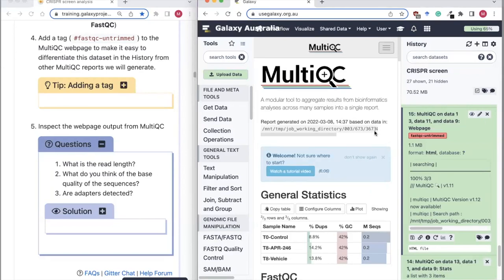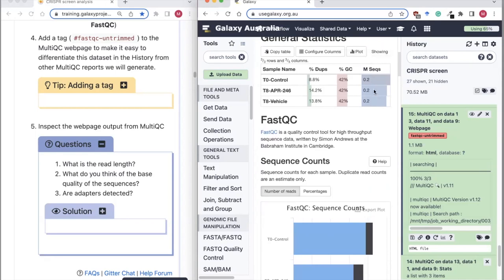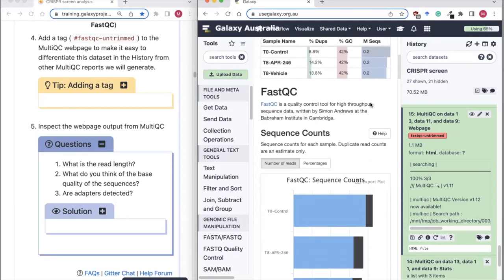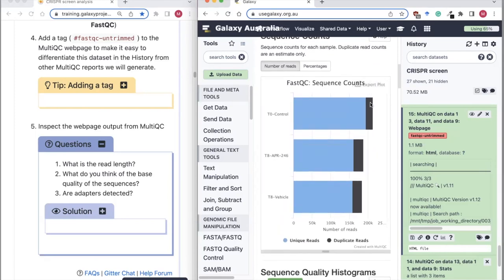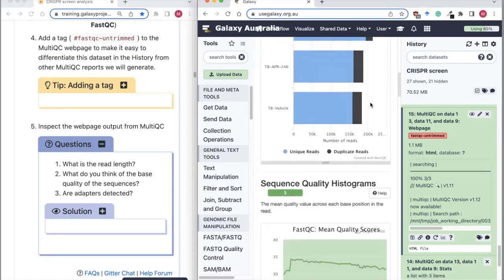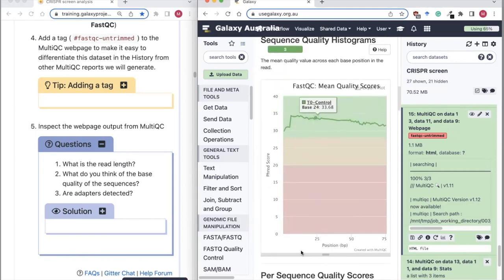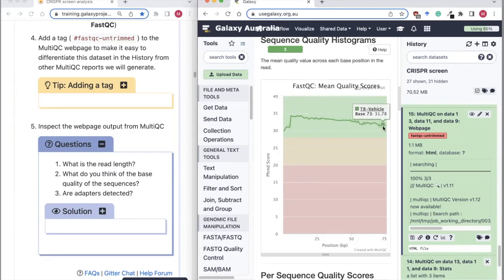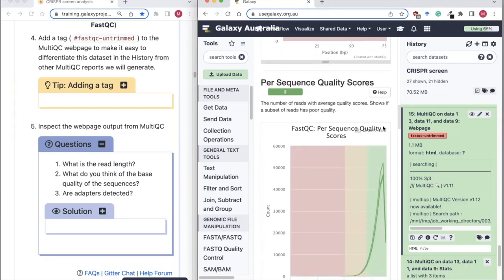If we click on the eyeball, we can have a look at our FastQC report. We can see how many sequences we have for each sample — just a small amount for this tutorial dataset. There is a Galaxy tutorial on quality control that goes through these FastQC plots in detail. Here, we're going to have a look at the base quality along our read length — our reads are 75 bases and we've got good quality throughout.